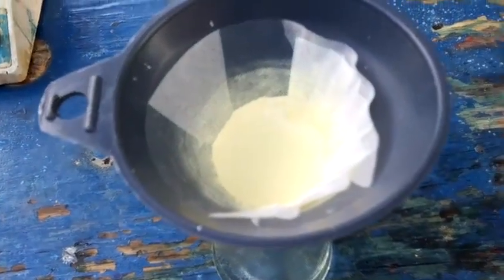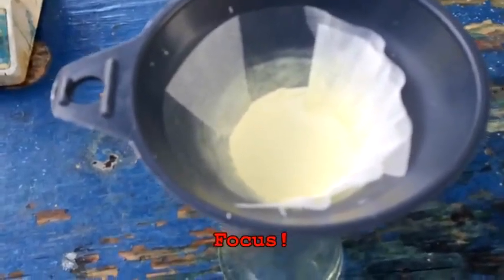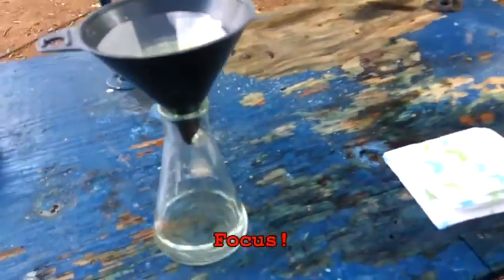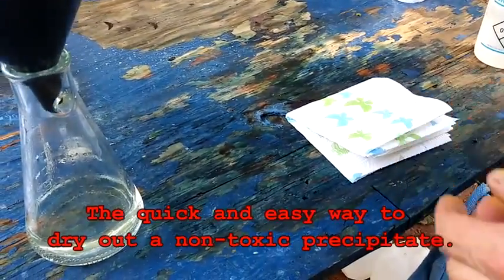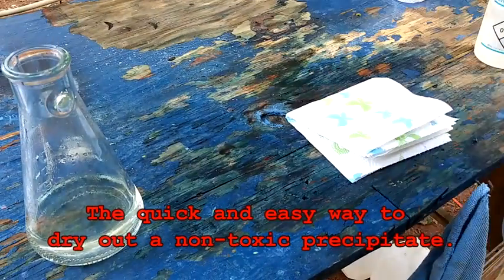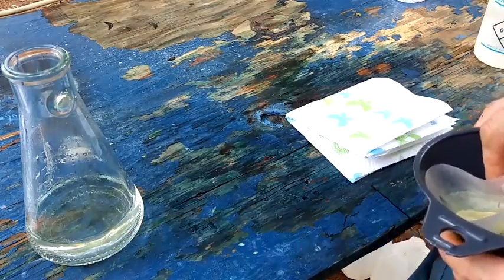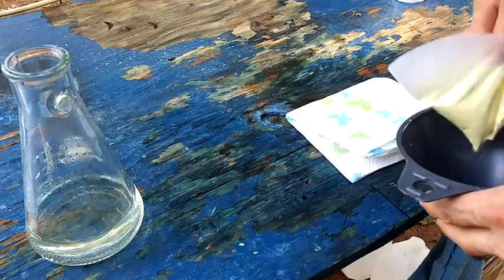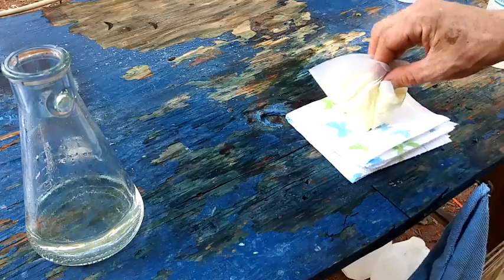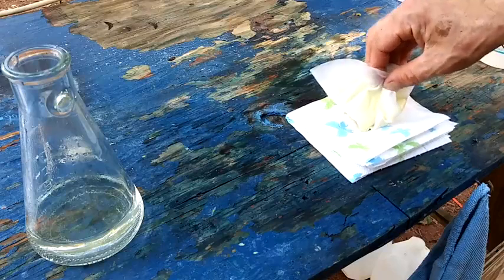Okay, so we've got our bismuth oxide, Bismuth Trioxide here, and it is ready to be dried. So I thought I would show y'all how I usually do this. Just take it out of here, out the filter paper with everything on it. Okay, it's still kind of wet here. We're just going to put it on here to let it absorb the water that's in here.